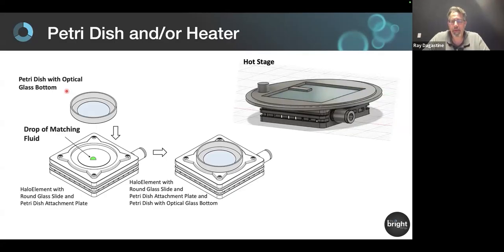but we actually got pretty good results with the 20x. And of course, what was different was you need to keep things warm, so we've integrated an off-the-shelf IVF heater, and we have a holder that'll hold that in place, and you can throw your petri dish on top of that. So we can keep things warm as well, because the stem cells I was looking at last week were at 37C, and we only looked at them for an hour or two, so we kept them warm. Obviously, we didn't have an incubator or gases in there as well, but at least we thought warm was the first good step.